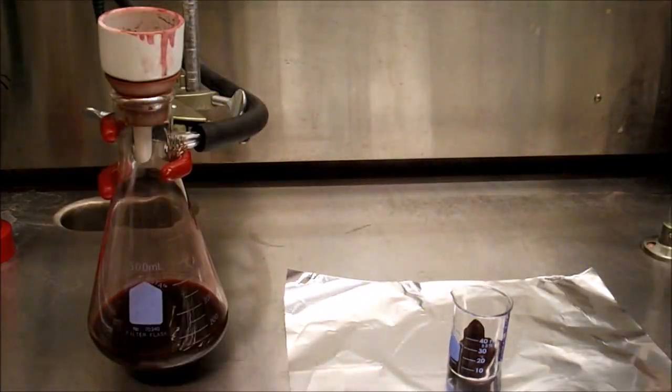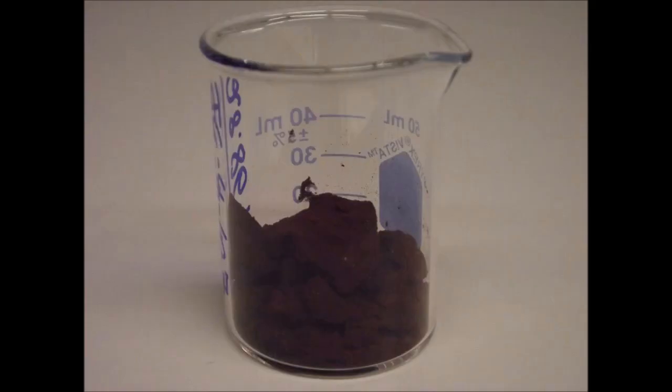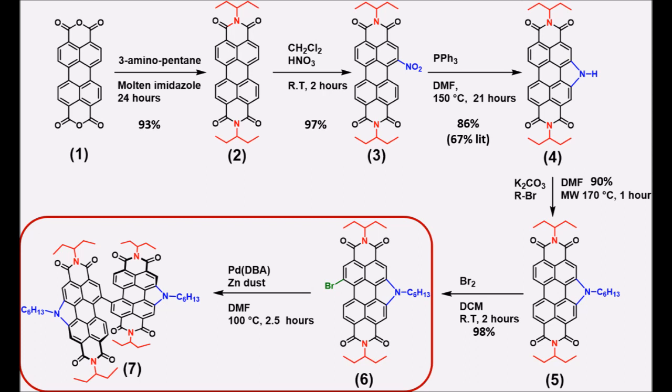To confirm the purity, we can once again look at the proton NMR. As usual, we can see the chloroform peak at 7.2 ppm, but we can also see a peak at 5.2 ppm, which corresponds to residual dichloromethane. A highly characteristic peak for this product is the one at just above 10 ppm, which correlates to the one remaining strained bay proton. Since all other peaks also correspond to the product or volatile solvents, we can be certain that we have pure product.